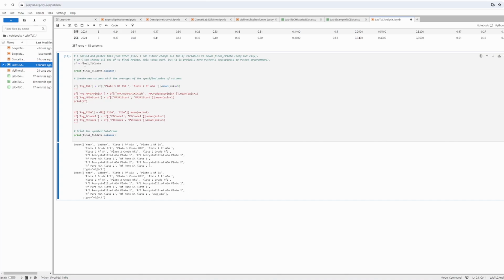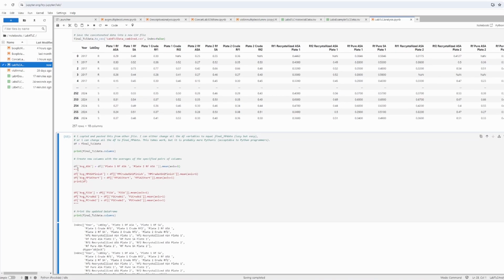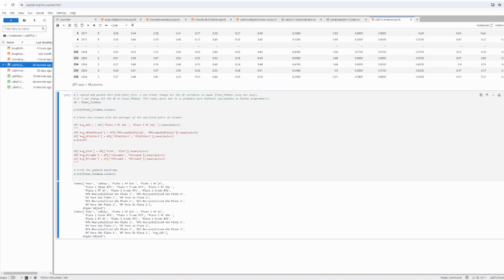I've printed the final TLC after we've done this work on it. So there's this one here where we just transferred the final data variable and called it DF. I did that in a previous video because it was just easier and we're lazy. By we, I mean me. If we wanted to be very Pythonic, we would take this variable here and use that in place of df. But there's several of these that I've got to go through, and df was much easier to use. Because I had it previously done already with the melting point, it was just easy to copy and paste everything over.